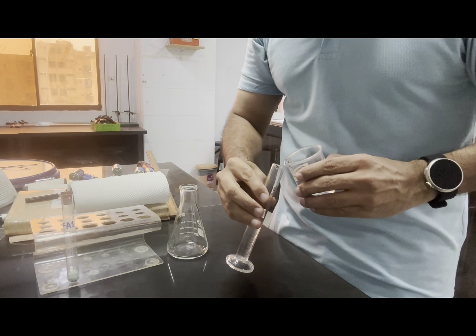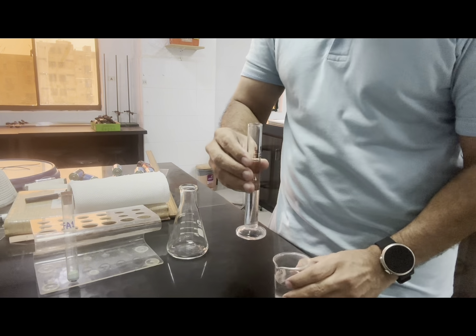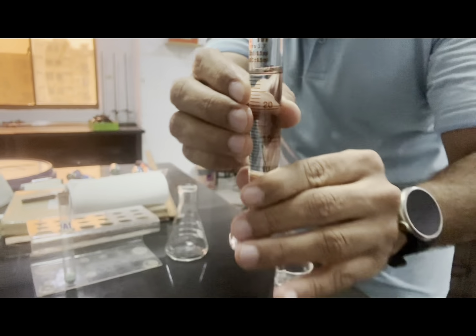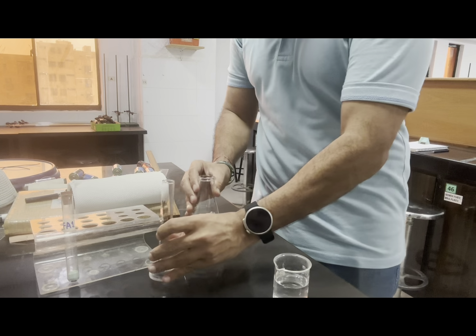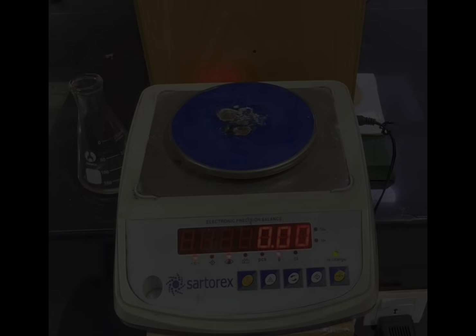So here it is, 25 cm³ taken, and transferred into the conical flask. Next step says, weigh the flask with acid, record the mass, and weigh the container with Fa1, record the mass. So let's measure both masses now.